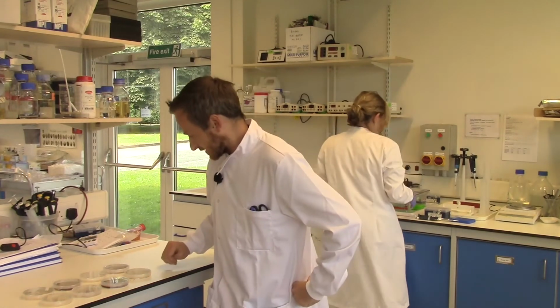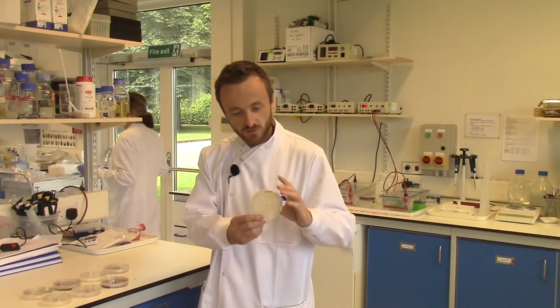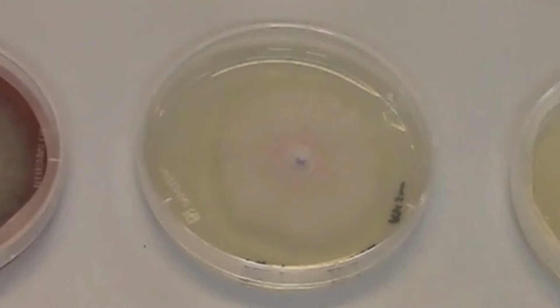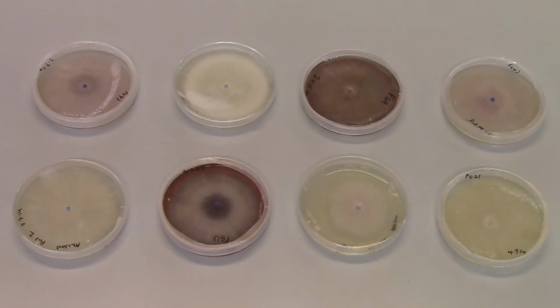I have a couple of examples of what Fusarium oxysporum looks like in culture. This is a typical plate of Fusarium oxysporum that would infect onion.